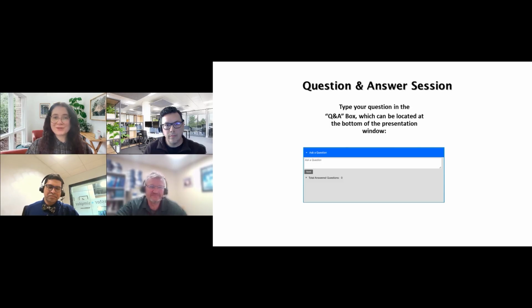Fantastic. We're going to go to our next question, which I think may be a good fit for both Chris and Eddie to answer. So feel free to jump in, which says, what is the recommended liner for going to lower level detection? I could jump in if you don't mind, Chris.